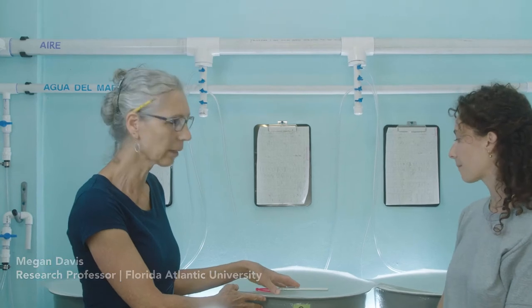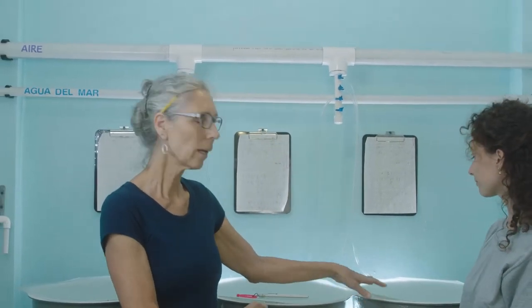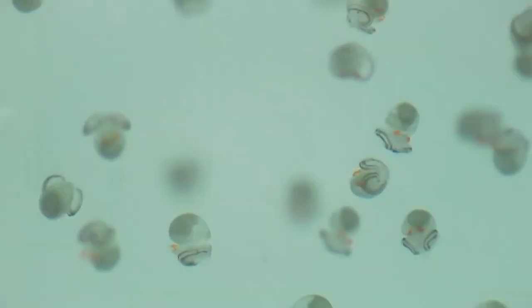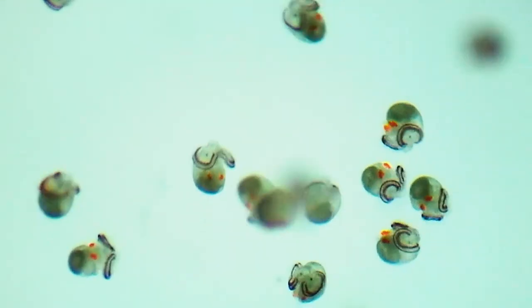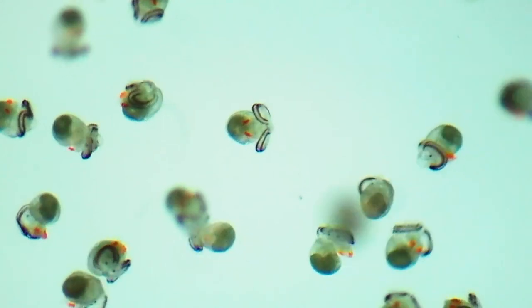Today we're going to do water changes. It means that we're going to take the water from one larval tank and transfer the veligers to another larval tank — removing the water completely because they've been in it for 48 hours, two days. Every two days we drain the water out, collect the larvae, and move them into clean water.